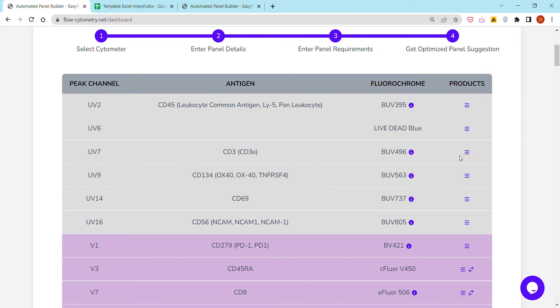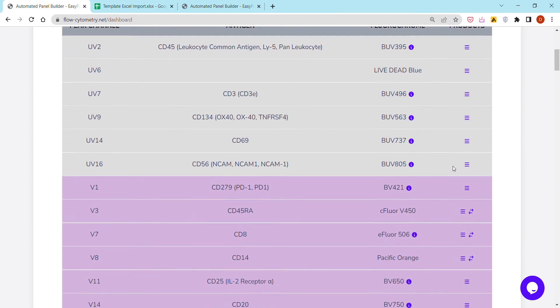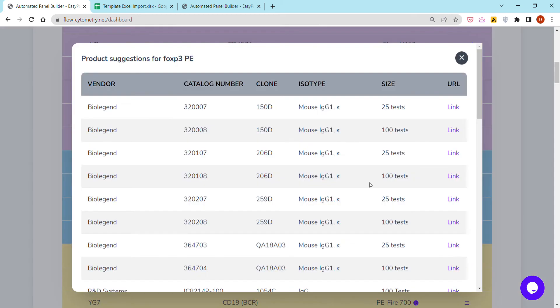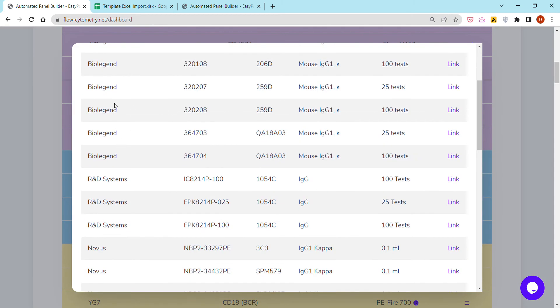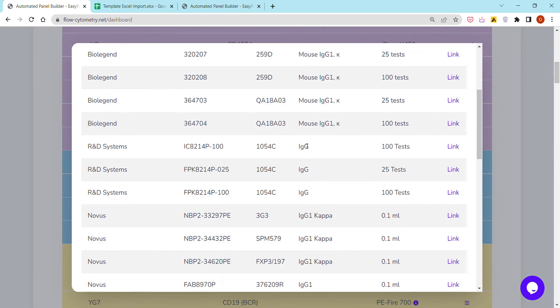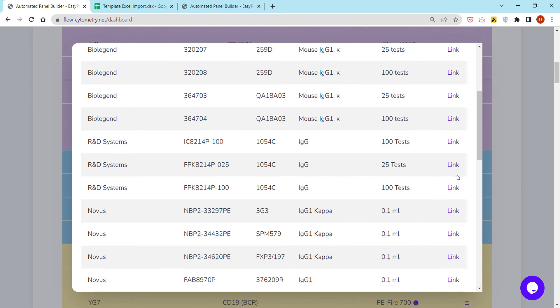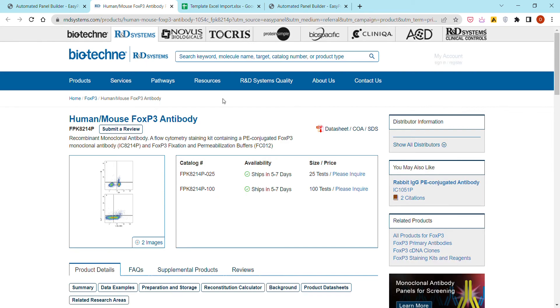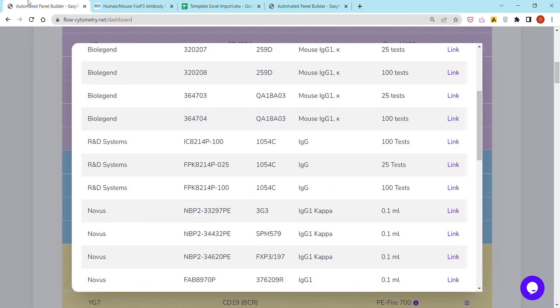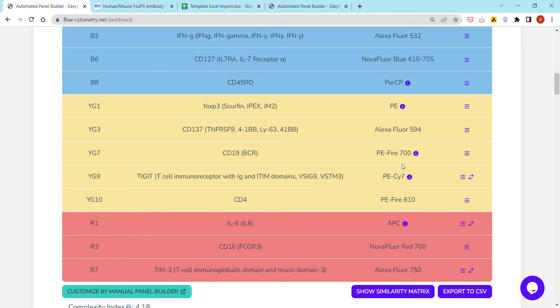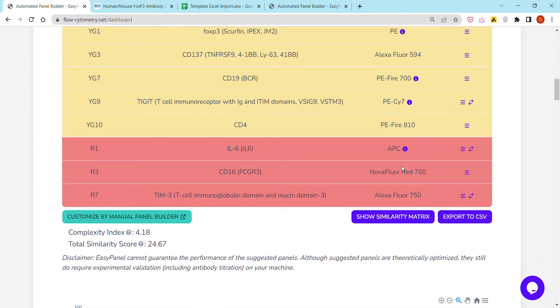Commercial products. So for example here, FoxP3, you can check this and it will show you the different commercial products grouped by vendor, as well as the name of the clones. You can click on whichever link you're interested in and you would get redirected to the vendor's page.